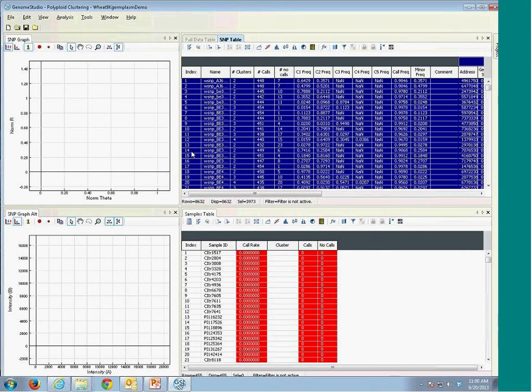because of this, copy number can affect some of the cluster positions. So often one of the clusters has been shifted. And because wheat is a self-pollinated crop, in most cases I would expect to see only 2 clusters. So what I do next to check how the clustering is doing is I normally like to sort the number of clusters.